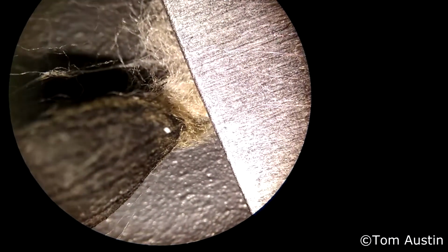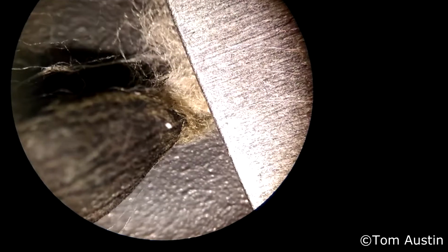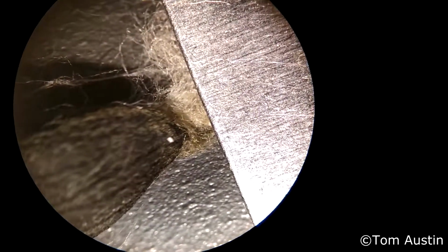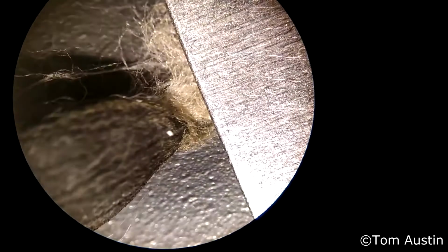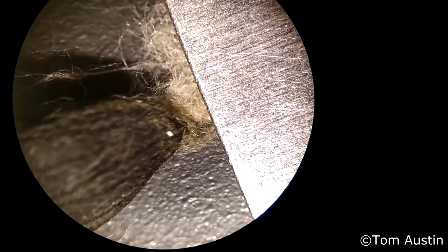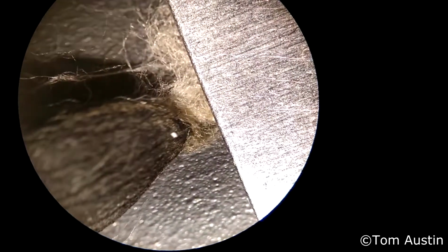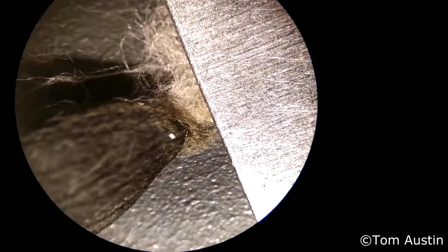Here is the tip of the seed, and you can see where the cotton is emerging from the seed coat. It's only emerging from the tip and the very end, which is a very good sign. That means that the likelihood of this being hybridized is very low, which is definitely a good thing to see. This is very much just a run-out strain. It's not been hybridized to death, which is very good for the genetic integrity of this crop.